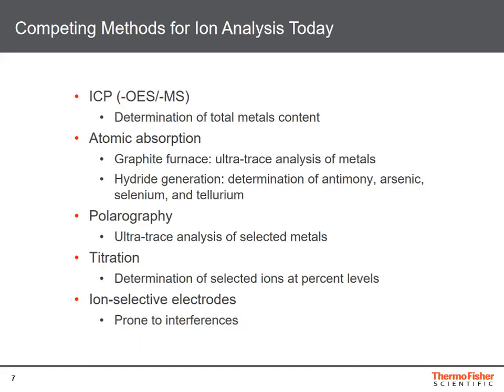However, if the oxidation state of a metal is of interest, then we have no alternative but to hyphenate an element-specific detection system such as ICP with chromatography to separate the two oxidation states of a metal such as iron 2, iron 3, chromium 3, chromium 6, and the various inorganic and organic forms of arsenic.